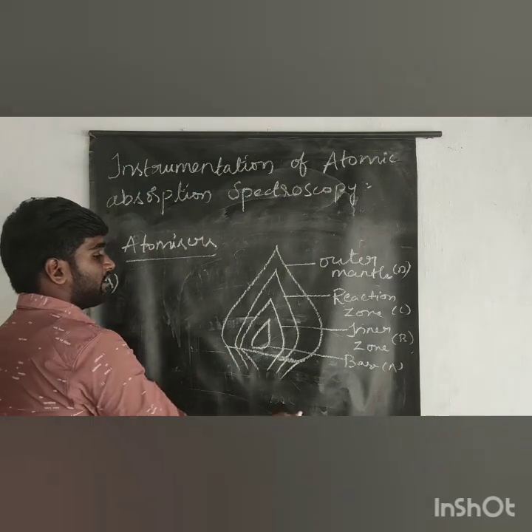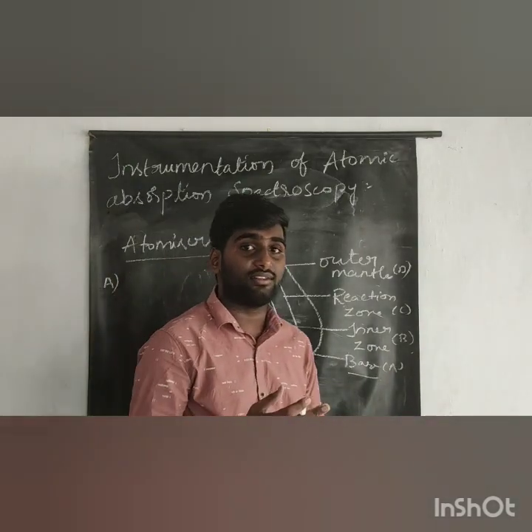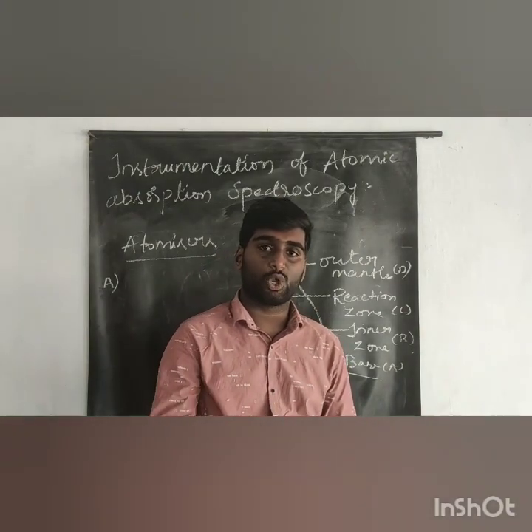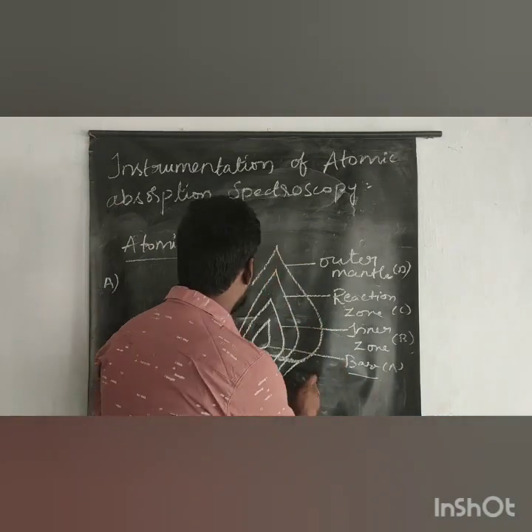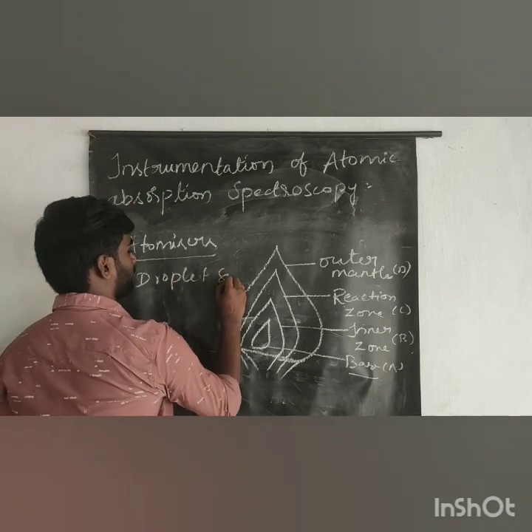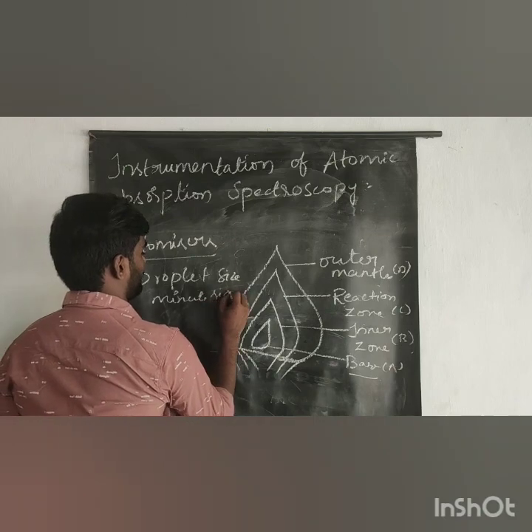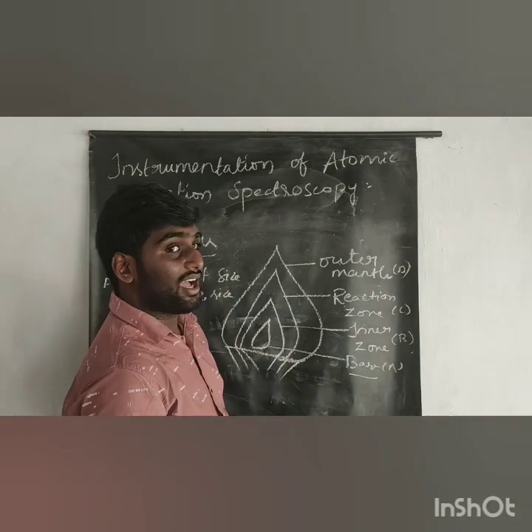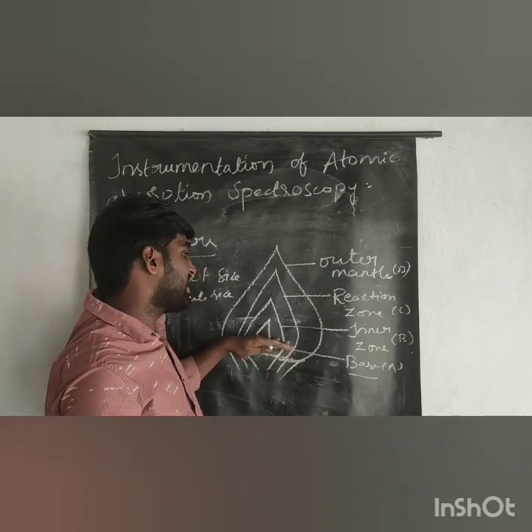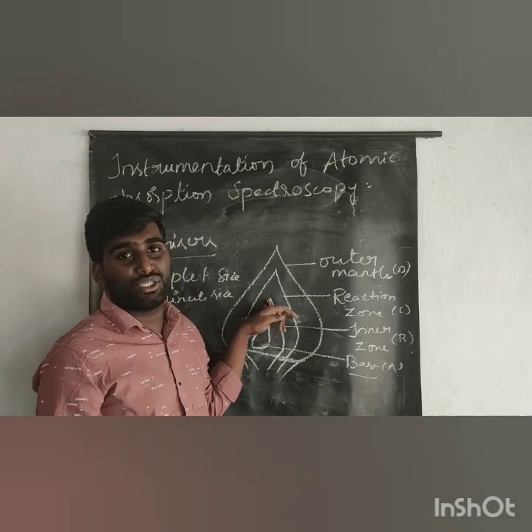Here is the function of the base. The sample will be in minute, droplet size, and it enters into the base of the flame. After entering the base, it goes into the inner zone.